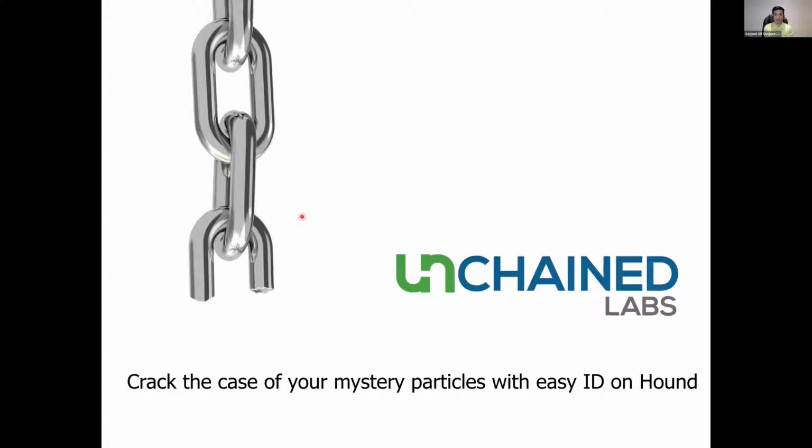All right, so let's begin. As Kevin mentioned, I'm going to talk about how we can use Hound for easy identification of mystery particles.